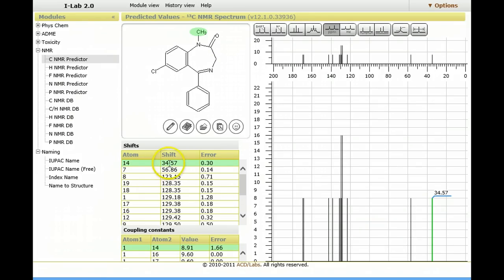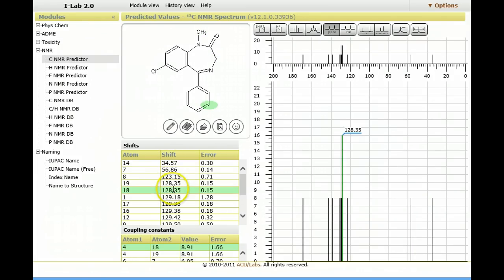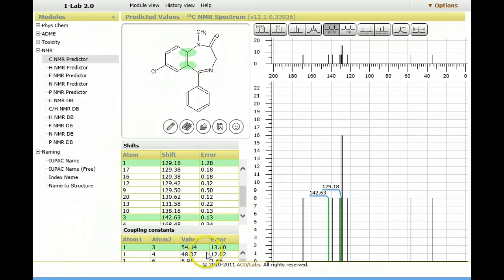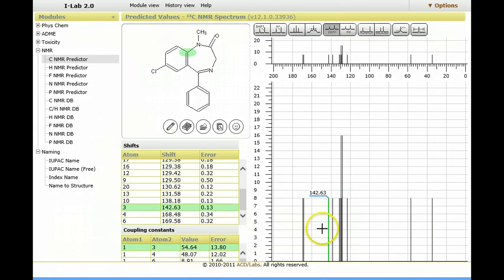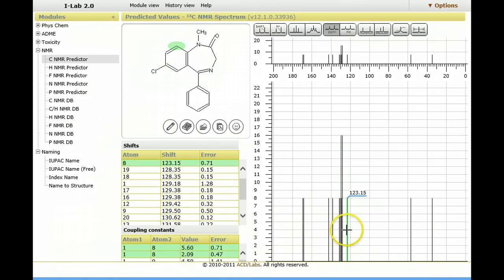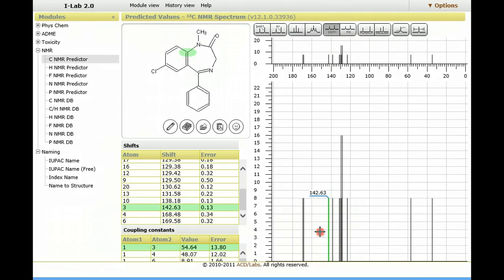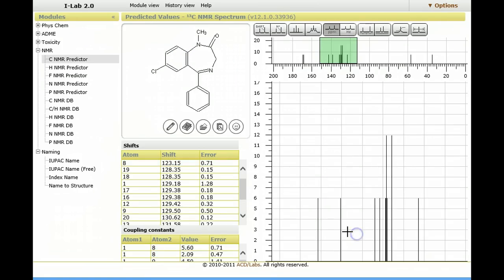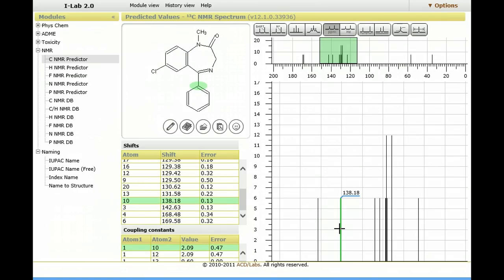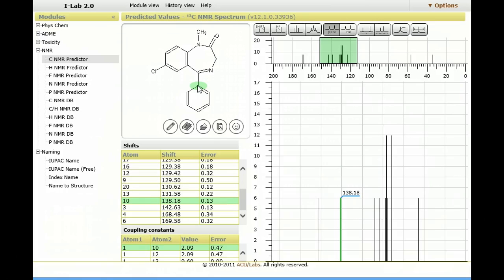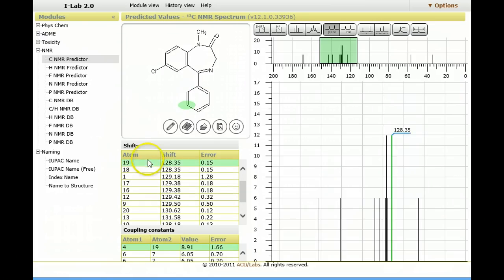And here you see the chemical shifts, the errors, and the coupling constants. And you can see a very interactive, rich interface here, where I can zoom in. And as I hover over a particular resonance, you can see the interaction between the table and the actual nucleus highlighted on the molecule. So that's carbon.